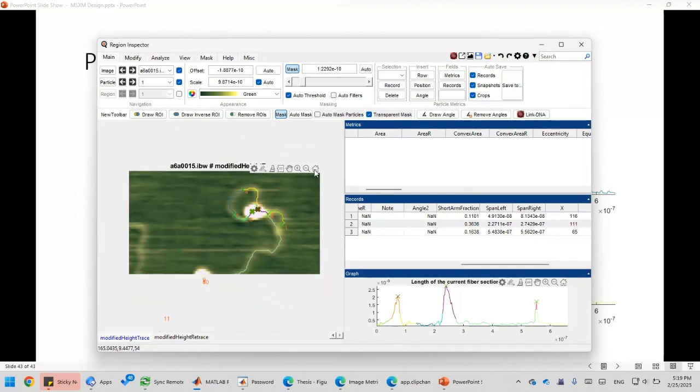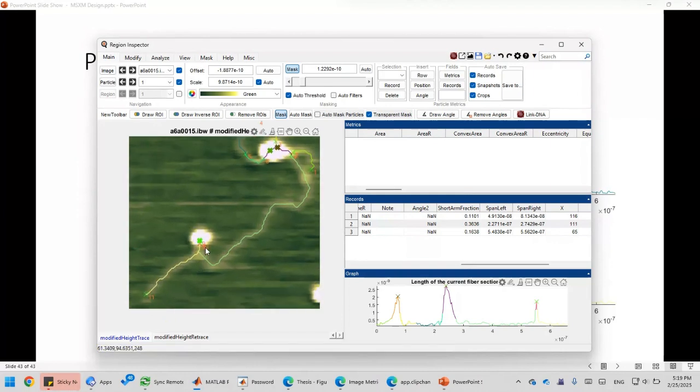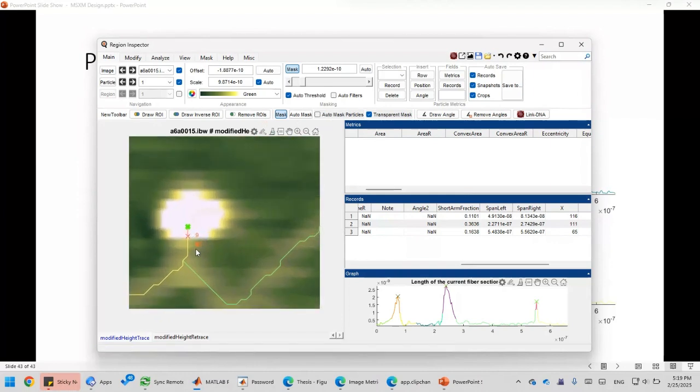And I think the same can be said about the second protein complex. We can see that because it goes in and out in the same way. So that's, I think, 10 and 8. And they cannot be seen clearly because they overlap.